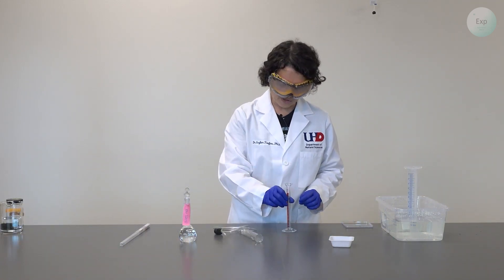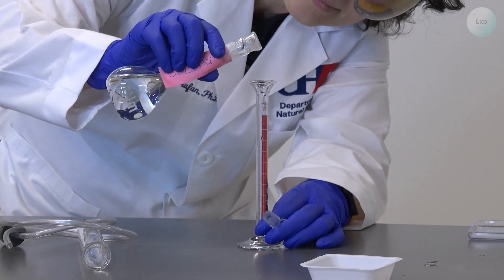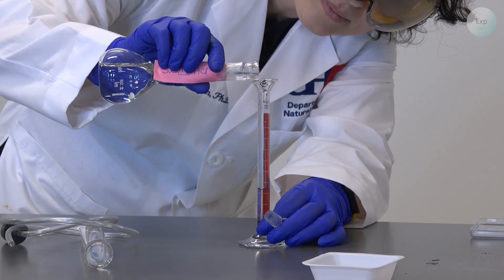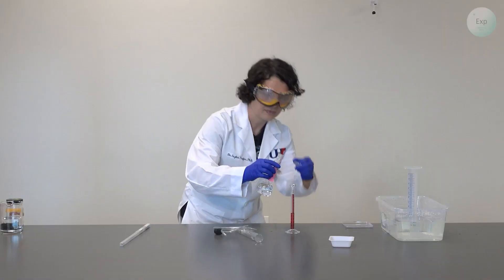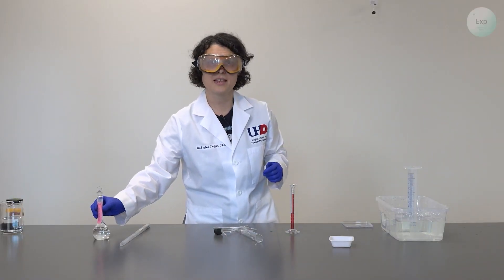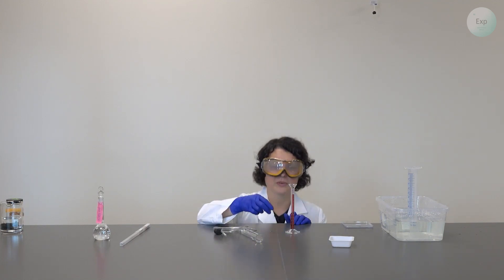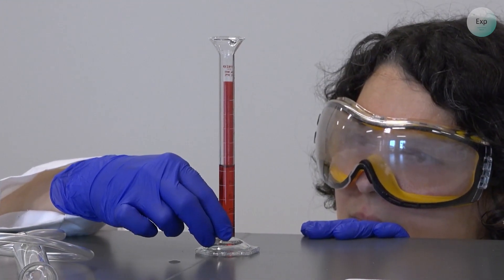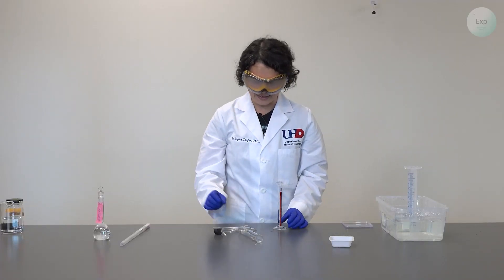Next, I am going to measure five milliliters of my 3 molar hydrochloric acid solution. It is okay if we use a little bit more — it doesn't have to be exact — but we should know how much of the 3 molar hydrochloric acid solution we used. So we record the volume at eye level. I have 5.28 milliliters of my hydrochloric acid.